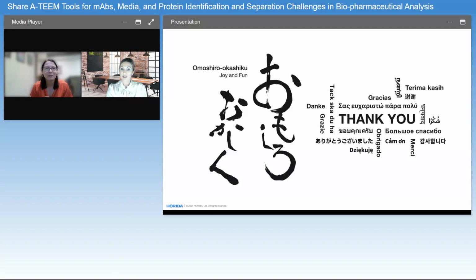Very good, thank you. Now, sometimes we see an overlap of multiple components in the contour plots. Is it the Parafac or any other analysis that can help differentiate the signals? Yeah, that's a good question. So yes, Parafac is specifically to distinguish overlapping signals which are broad. Fluorescence is a broad spectrum. It's not like Raman or FTIR, which can have very structured and very narrow peaks in comparison. And so parallel factor analysis can absolutely help differentiate the signals that are overlapping. Tryptophan and tyrosine overlap quite a bit, actually, depending on their environment. And so we use Parafac for this quite easily.